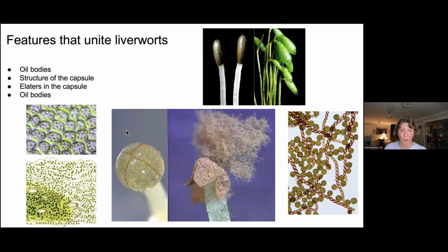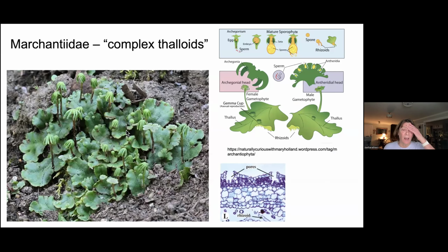We're going to focus on the two most common groups tonight. I'll have one example of some dissection of each. Marchantioid: Marchantia is the liverwort that everybody knows, where you have a thick thallus with a number of layers. Here's a cross section. There's an epidermal layer, some chlorophyllose layers, which are stained purple here, and a section of thin-walled cells full of water that are sort of like the parenchyma of a leaf, and then an underside. The sexual organs are borne on stalks under the arms of these umbrella-like structures, or on top of them.